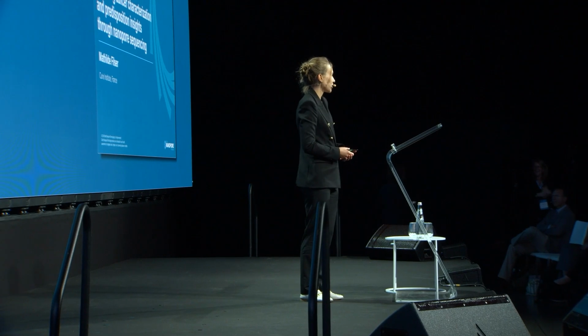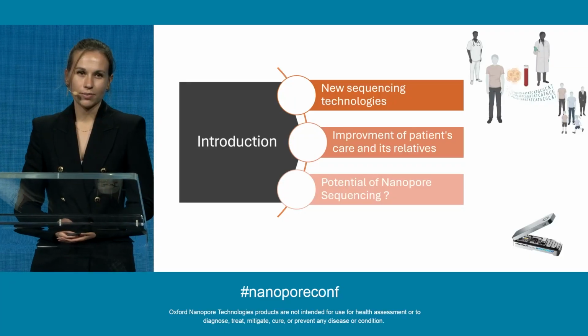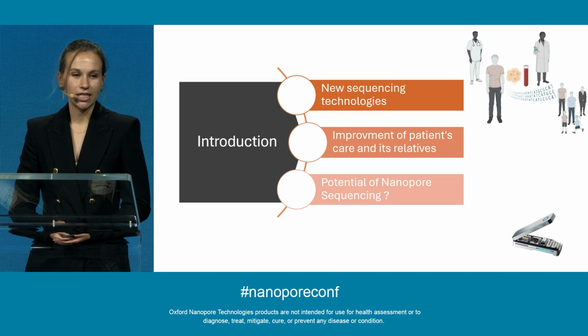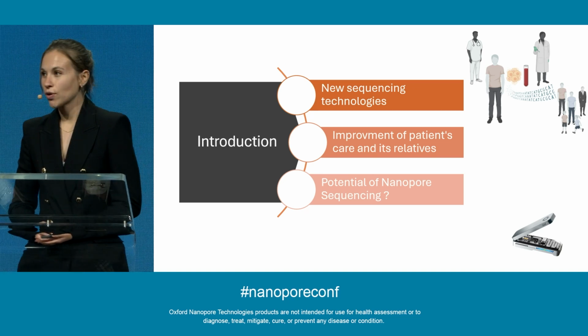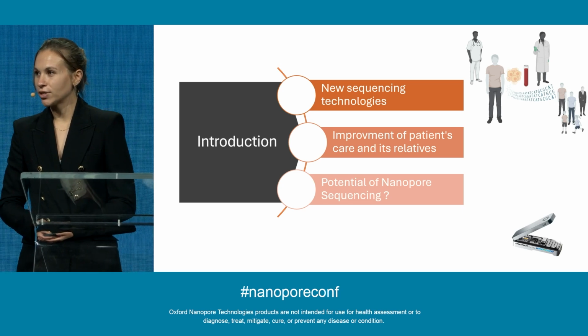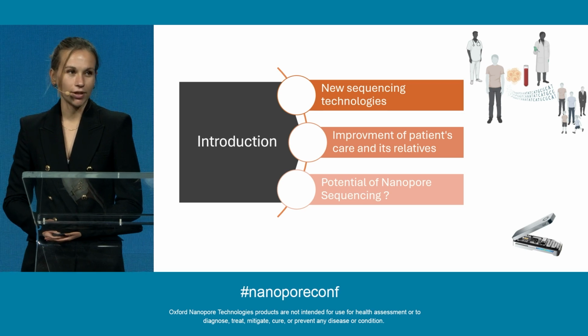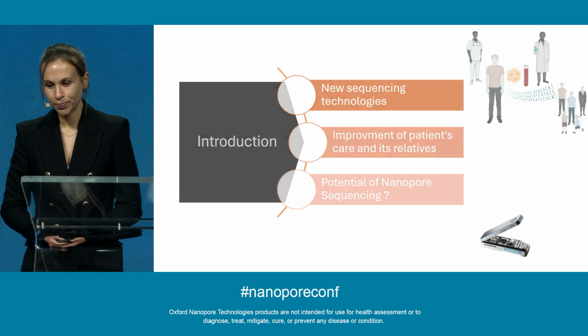Good morning, everyone. It's my great pleasure to be here today to tell you how we explore the potential of nanopore sequencing to transform cancer care, both at the germline and somatic levels. Within the past years, there has been a huge improvement in sequencing technologies and tumor understanding, which has led to a complete transformation of the way cancer patients are managed, while also having an impact on their relatives when a predisposition is identified. In this context, we were interested to see how nanopore sequencing could add value to this new definition of management.